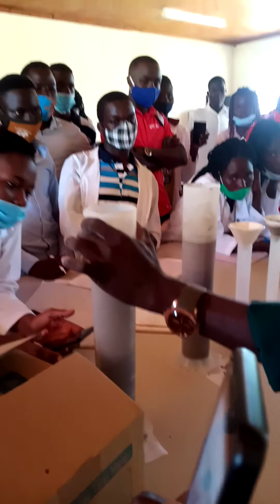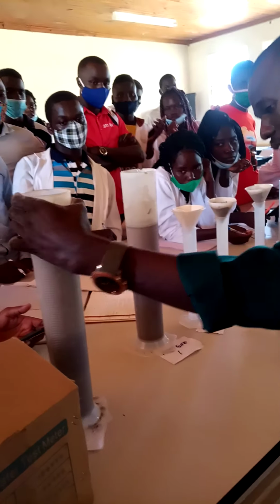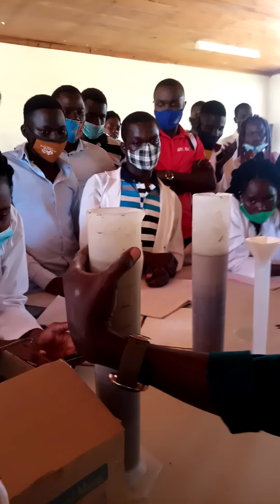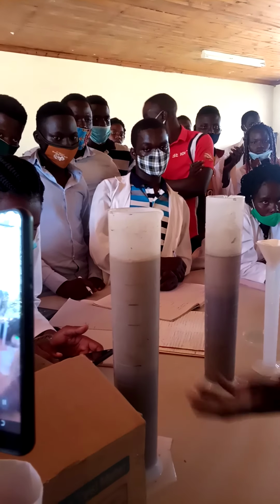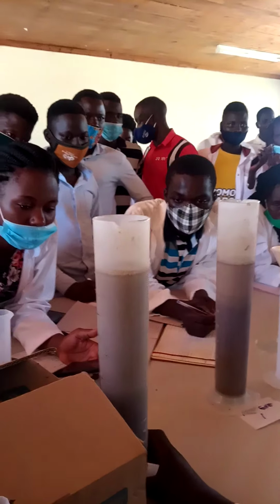Okay. This is a method used for determining soil texture. It has the numbers. So should we read this one first? Use your eyes and observe very well.